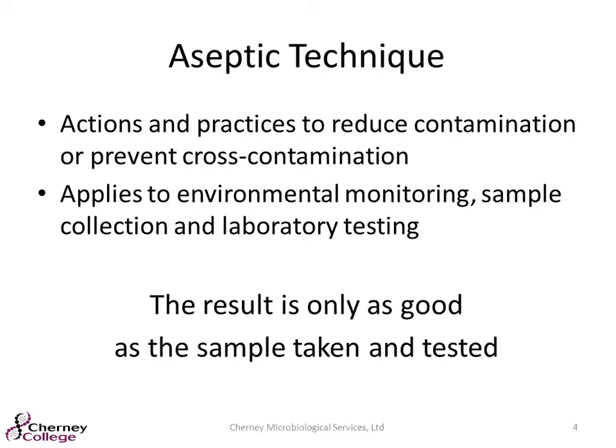And that isn't just when you are in the lab setting up samples. That is when you are in the plant taking your sample, when you're getting that sample ready to go to your lab or to be sent to us, and also when you are in the lab testing that sample.